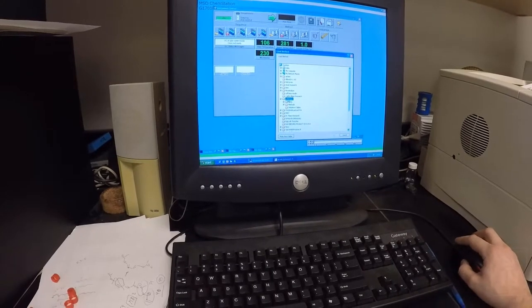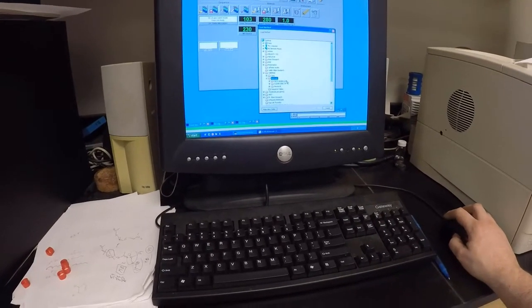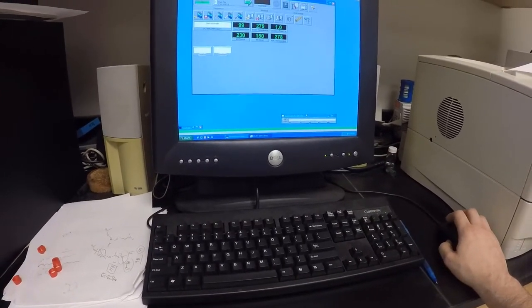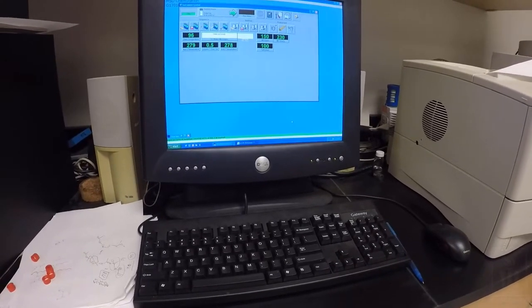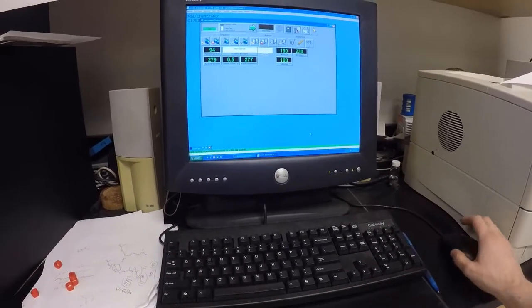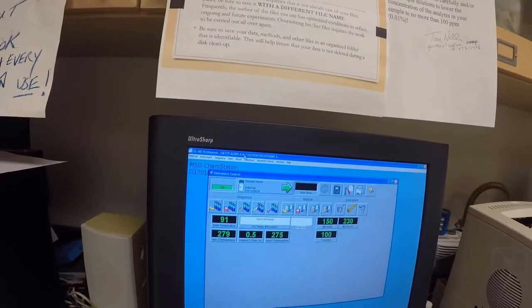There it is, CHEM 408 Methods. If you're doing fatty acids, you're going to want to use the fatty acids 2 method. This is what we're usually going to do for our autosampler, so I'm just going to load fatty acids 2. This is already set for all of our protocol pieces, all of our temperatures, and this will get the GC-MS ready to go. You can see that it's loaded up here. It says fatty acids 2.m. That's the method we want.